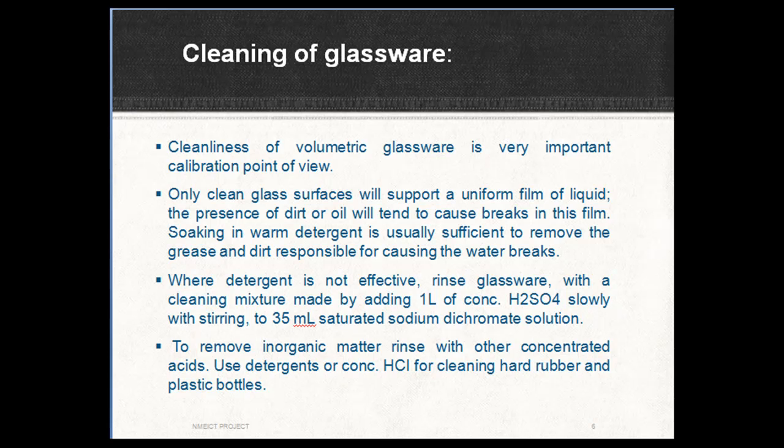Cleanliness of volumetric glassware is very important from the calibration point of view. Only clean glass surfaces will support a uniform film of liquid. The presence of dirt or oil will tend to cause breaks in the film. Soaking in warm detergent is usually sufficient to remove the grease and dirt responsible for causing the water breaks. Where detergent is not effective, rinse glassware with a clean mixture made of H2SO4 and sodium dichromate. To remove inorganic matter, rinse with other concentrated acids.